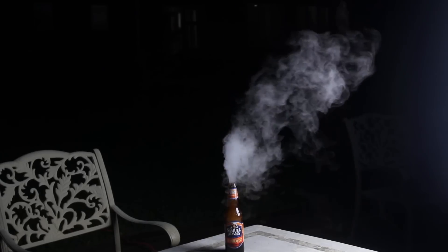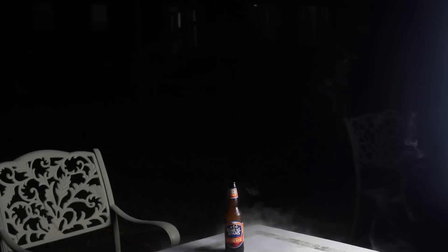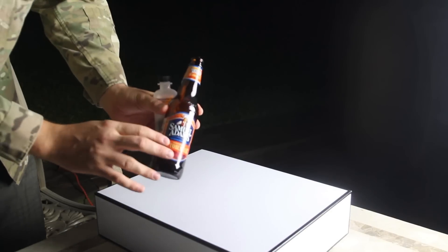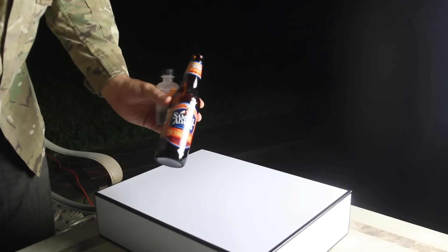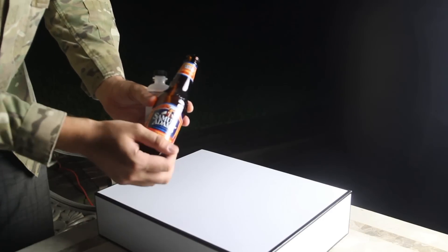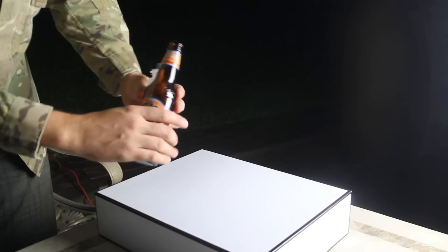Now look, it starts smoking — pretty cool! How cool is that? Alright, that was pretty cool, but I put a very little amount because that might get too hot and pop. So let's try something else — be careful, it might be warm to the touch.